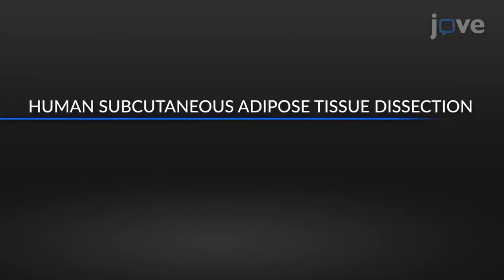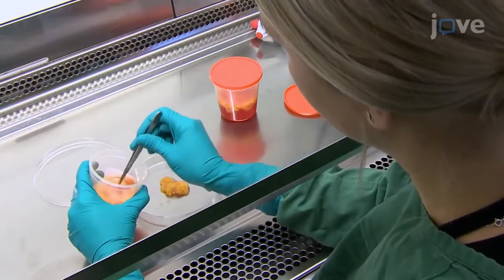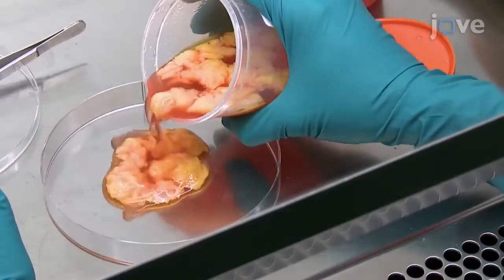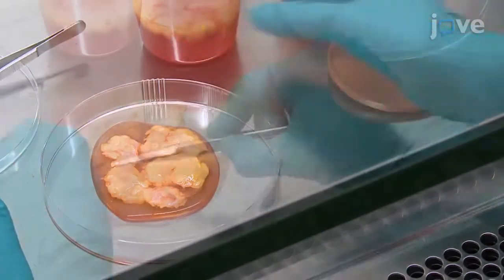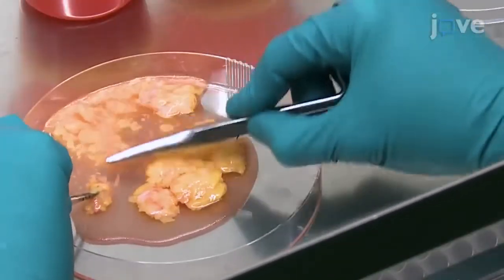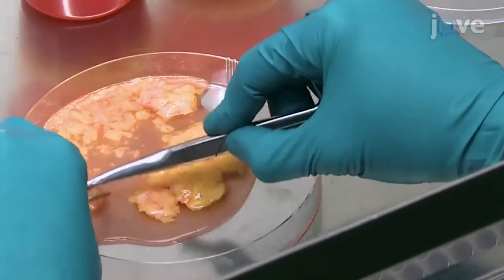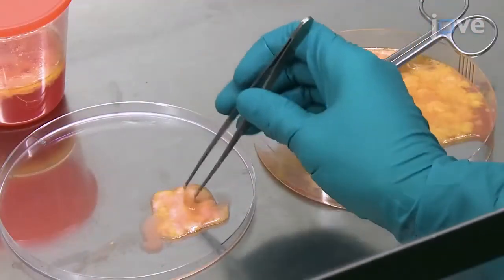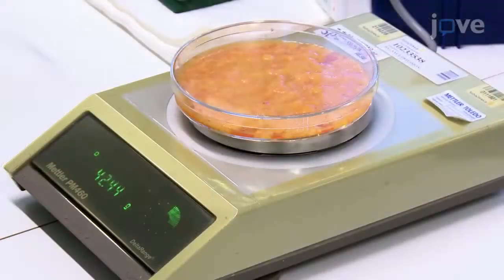After receiving the human subcutaneous adipose tissue sample, place the tissue in a sterile biological safety cabinet in a 15 cm petri dish with a small volume of medium 199. Use tweezers to grasp large fibrotic vessels within the tissue and use the back side of the tip of a closed pair of scissors to gently scrape the adipose along the vessel to release the adipocytes. When all of the cells have been collected, discard the large pieces of fibrotic tissue and weigh the trimmed fat.